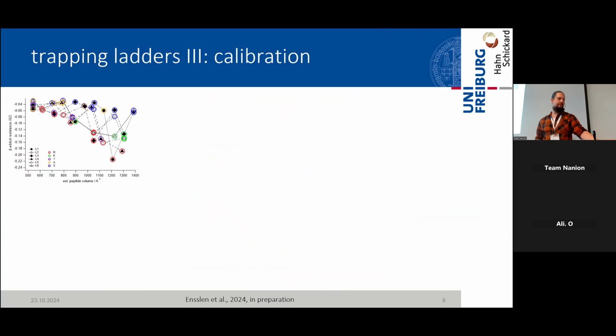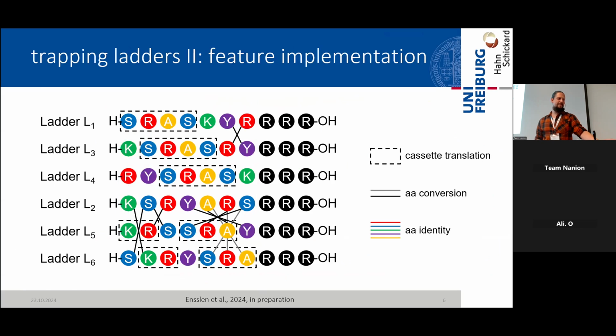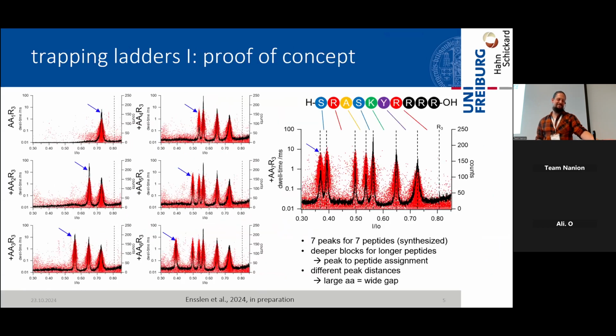What is sort of the limit? How long can you possibly make that? Because I would expect that if you get a little longer, the differences in size that you can possibly detect by blockage or different levels of blockage become very tiny pretty soon. How long can it possibly be?